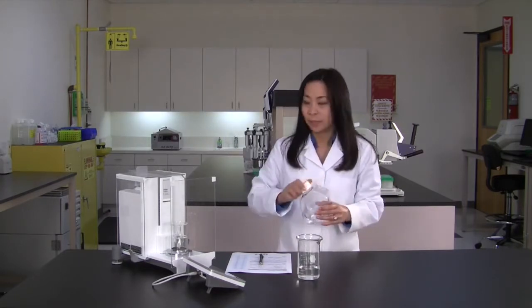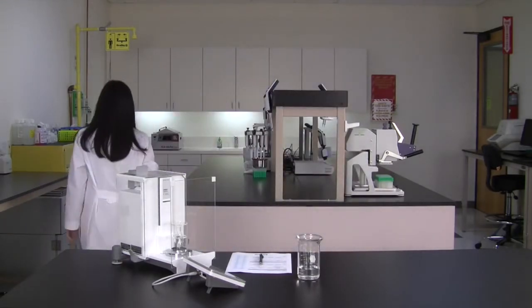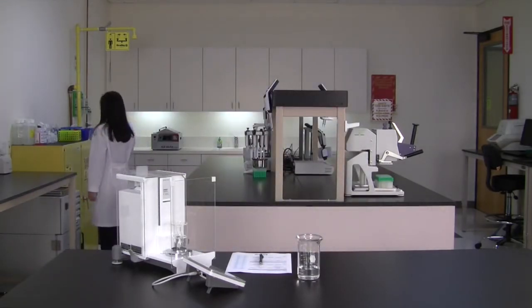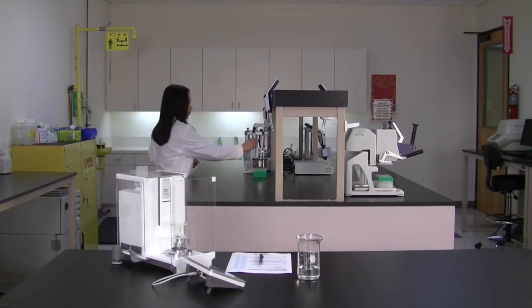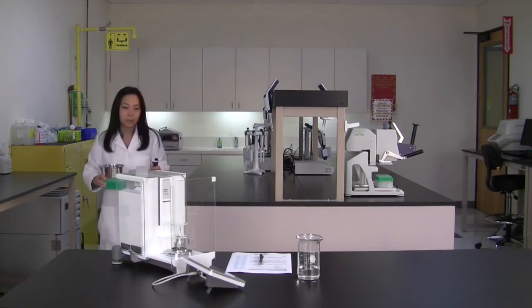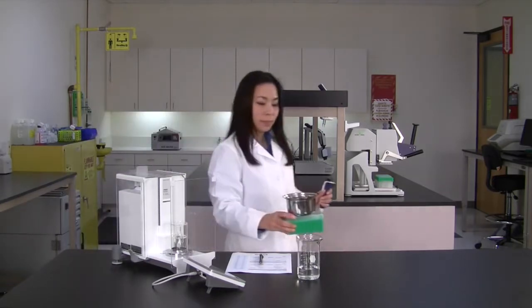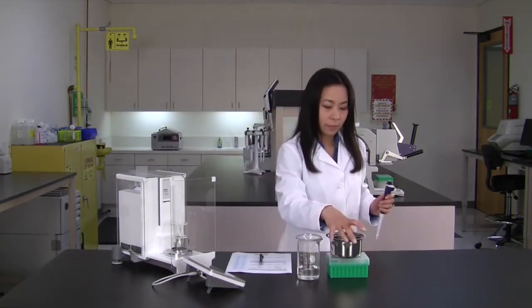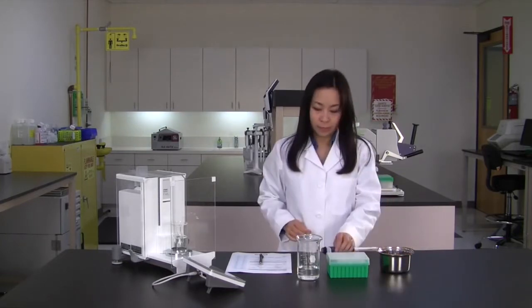For 100 microliter pipettes and larger, you can use a 5 place balance. For smaller volume pipettes, a 6 or 7 place balance is required. You'll also need an evaporation trap or vessel, some deionized water, and an area to work in that's free from drafts, direct sunlight, and vibration.